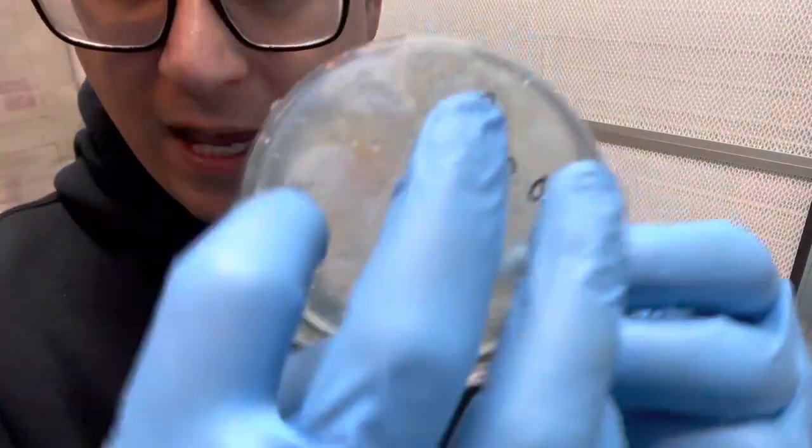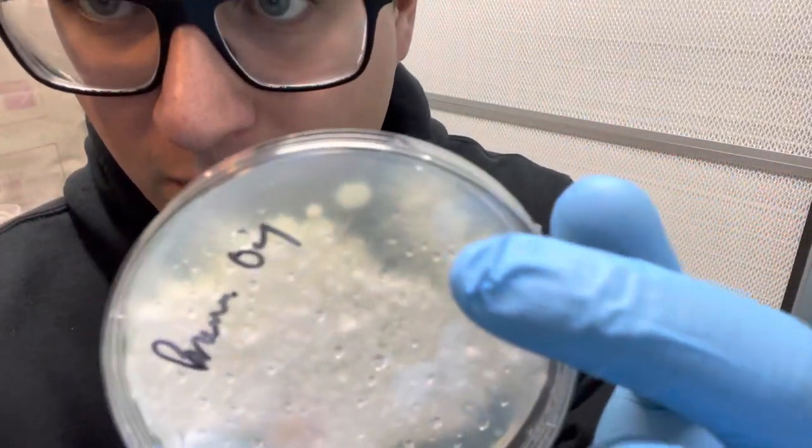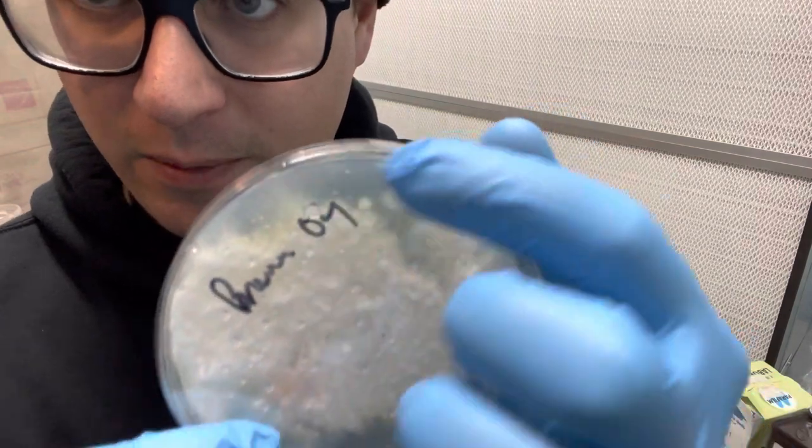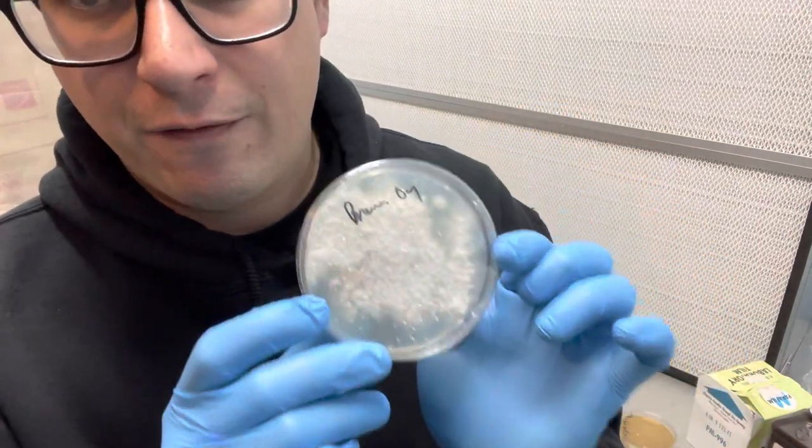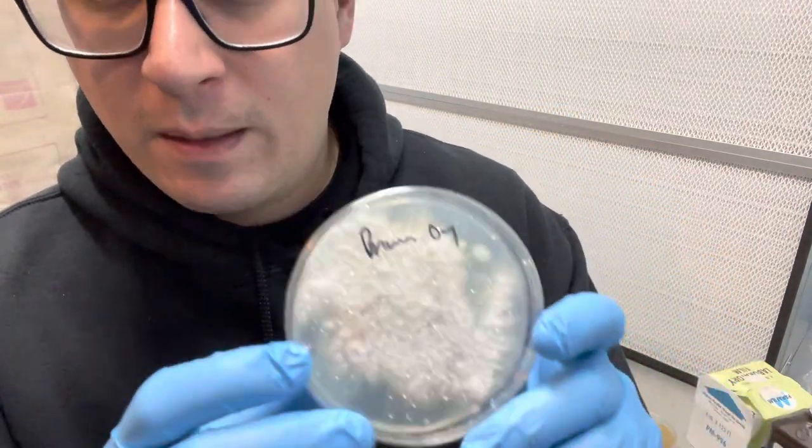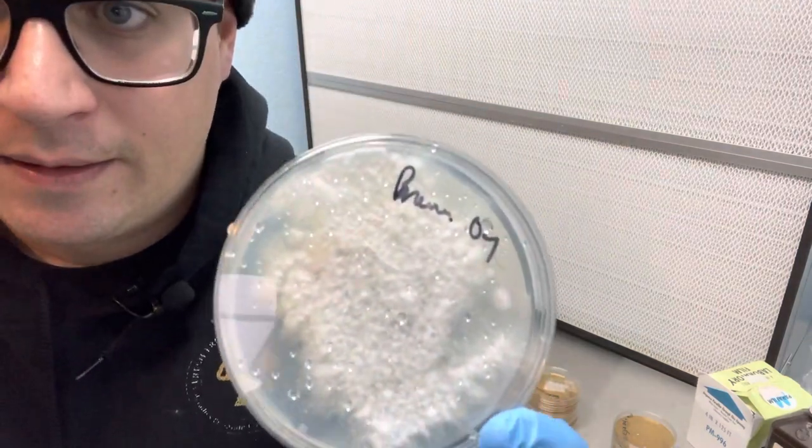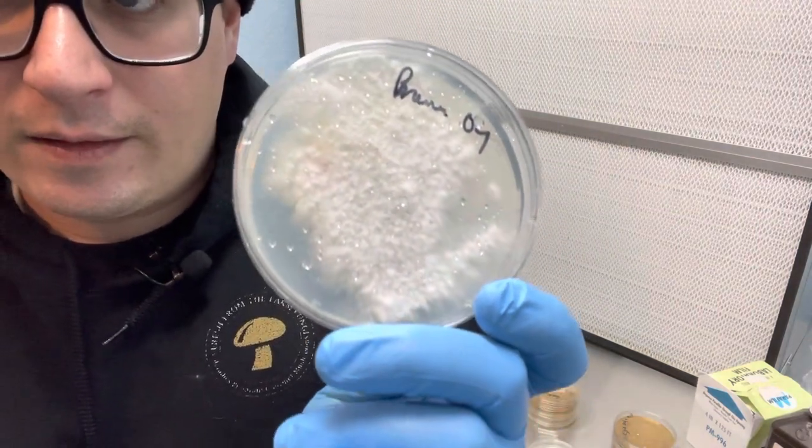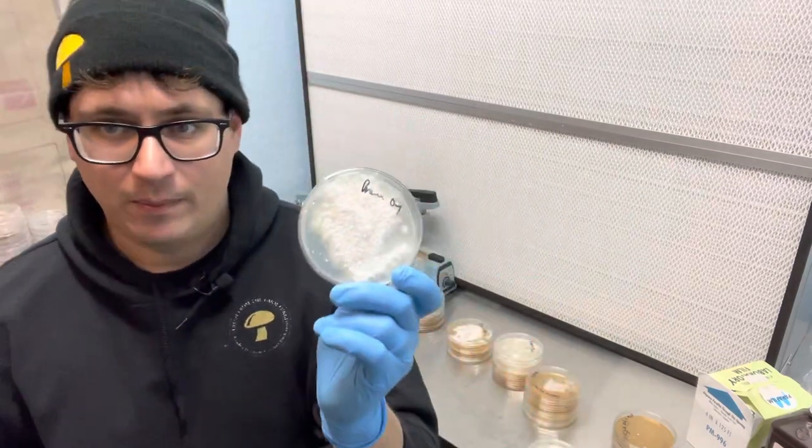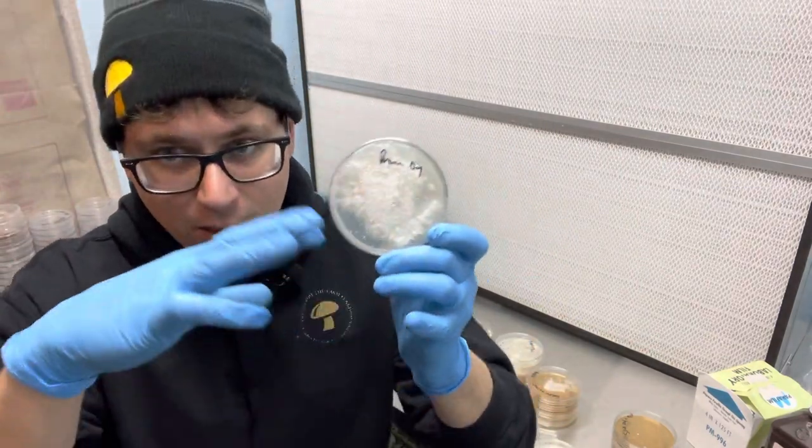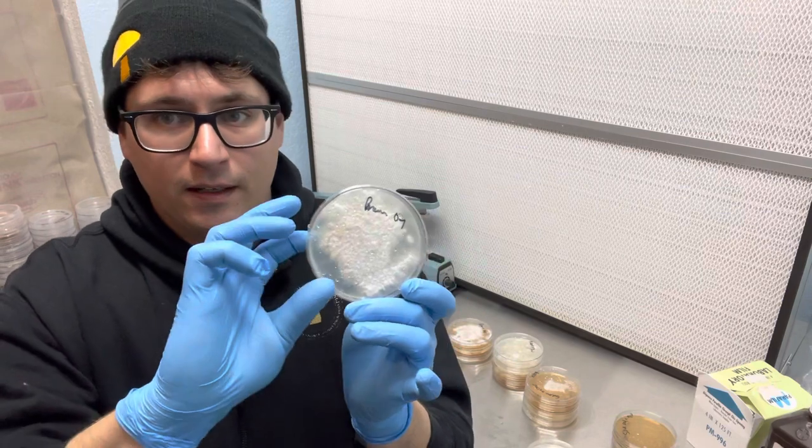The spores will kind of mate with each other, and then you can go through and select different healthy regions to create different phenotypes. But I wanted to point out that if you look very carefully, you can't see any bacteria because the mushroom mycelium has overgrown that bacteria.